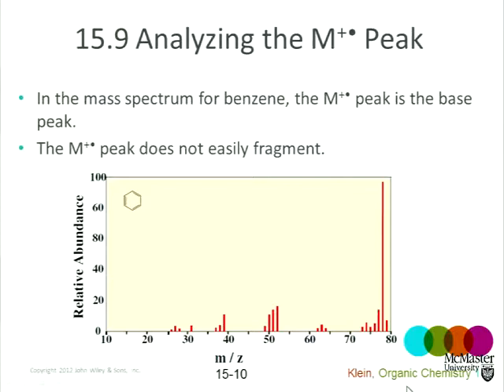Here now we can read the molecular weight at 78 here. We move along, we look for the peak at highest mass to charge ratio. That's the thing that is most likely non-fragmented, bearing in mind that we may have another little peak just a bit further up due to heavy isotopes of things like carbon-13.